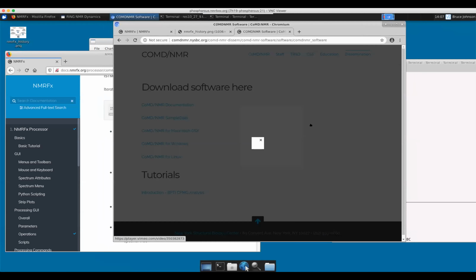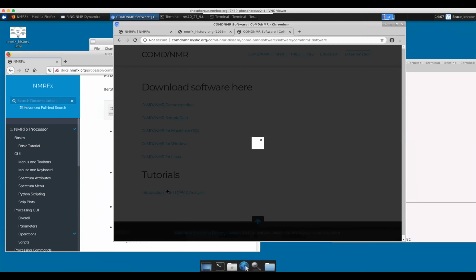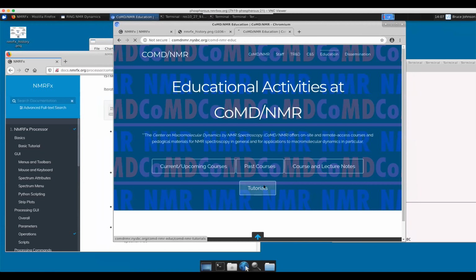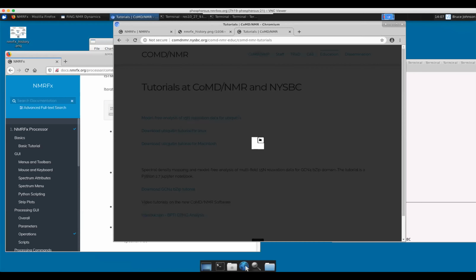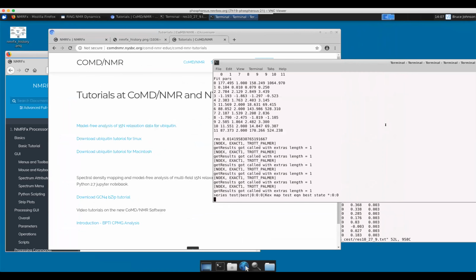And there is an introductory tutorial. It just does not seem to be running. Okay, that's good to know. It will be back soon. I think that's available on a different page as well. So maybe let's try there. Tutorials, video tutorials. No, something's broken on the website.